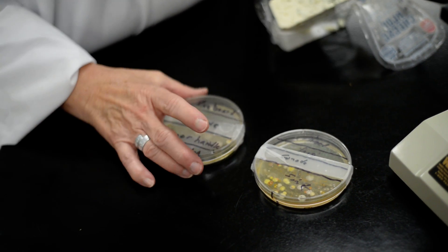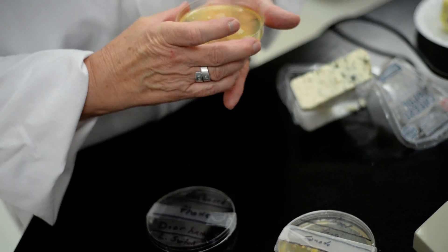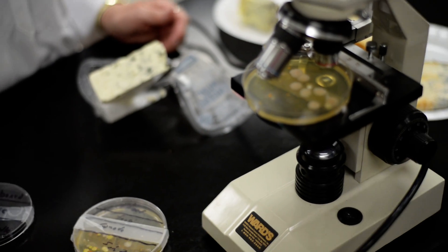While you're looking at bacteria or fungi, it's very interesting to see what they look like, but it would even be better to use them under the microscope so that students could actually see what those colonies look like.